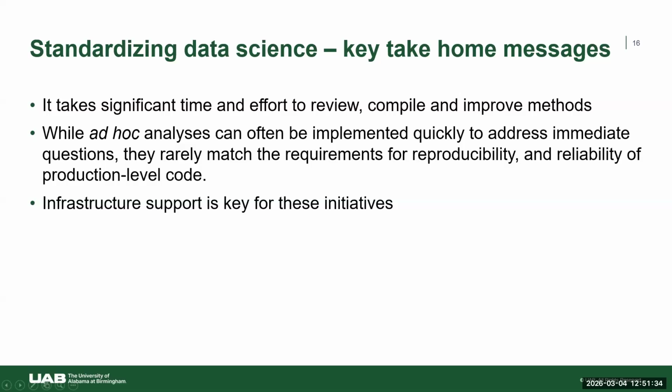Another factor in the context of effort here for any nf-core pipeline is the fact that this is not an ad hoc analysis. I'm not against ad hoc analysis, which is when you're quickly writing a script to get a quick job done. That can be great for prototyping, but that is far from matching the requirements for production level code, right? Production level code needs to meet reproducibility, reliability, it needs to be standardized. A quick Python or Jupyter notebook that is not being reviewed, that's not parameterized, or RStudio, that's fine in most cases, but not for production level code.